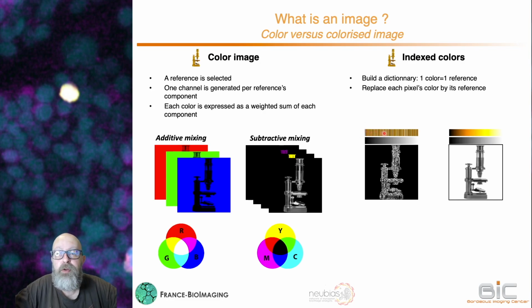You may have blue, for instance, in the mid-range, around 128. And wherever you find 128, you will put blue.